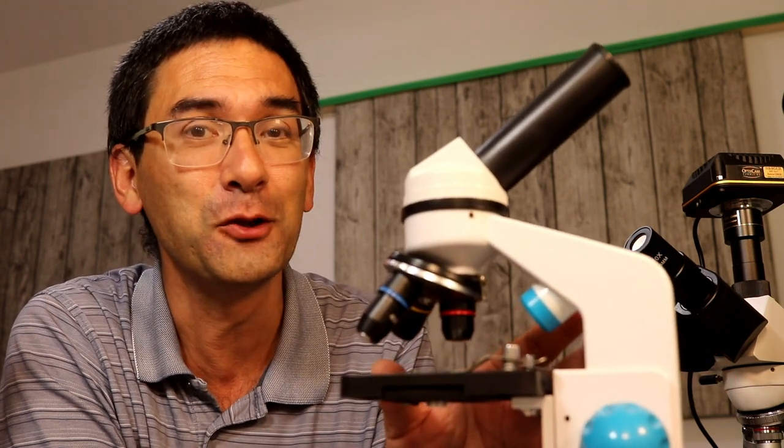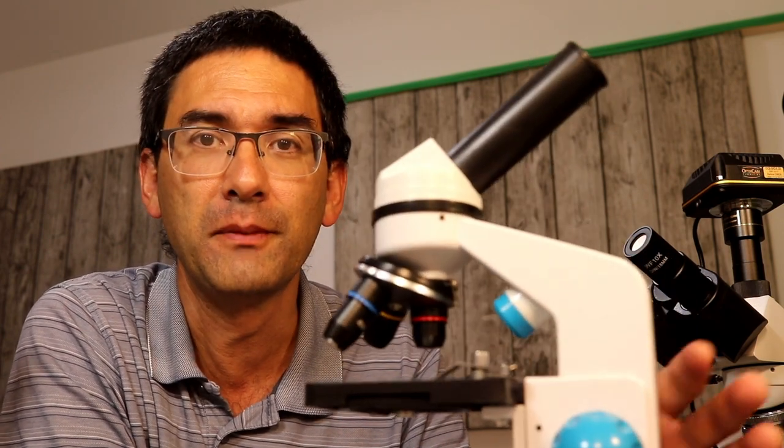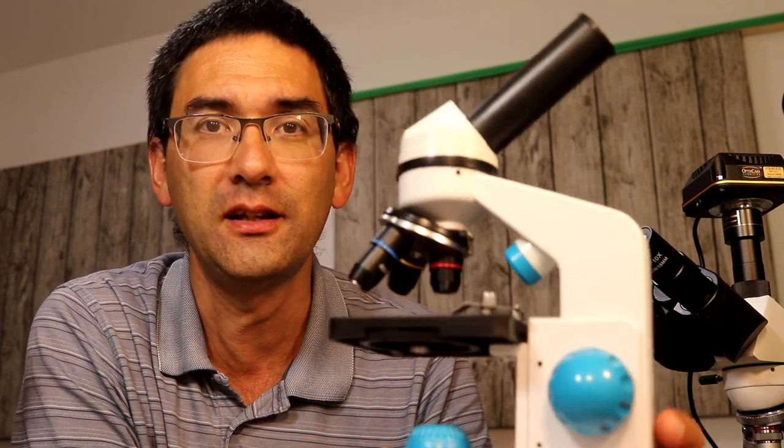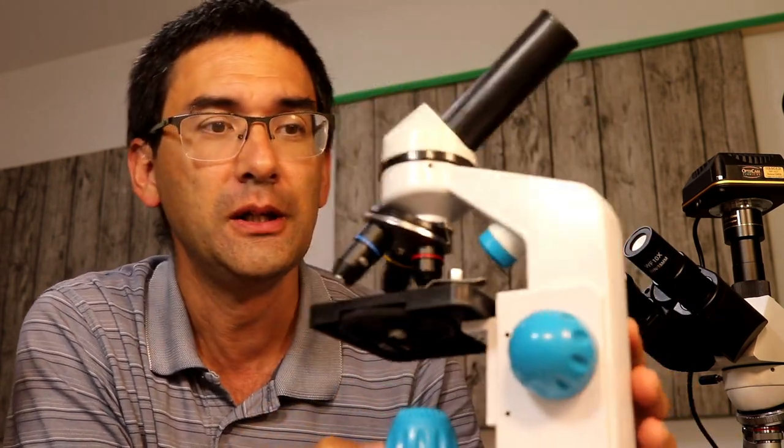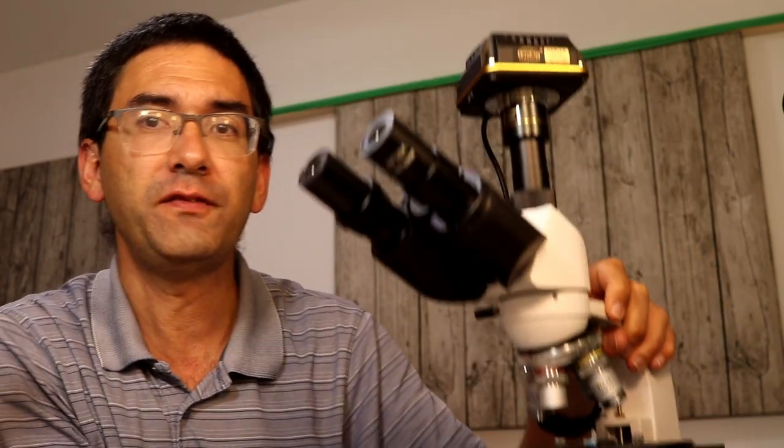Microscope.com also has monocular versions which are cheaper. I think this can be converted quite easily. Yes, there are those introductory children's microscopes. This one has the advantage that the stage can be easily disconnected because there are two screws on the bottom. You can take off the whole stage and replace it with a 3D printed do-it-yourself solution or a stage made of wood with a rotating mechanism.